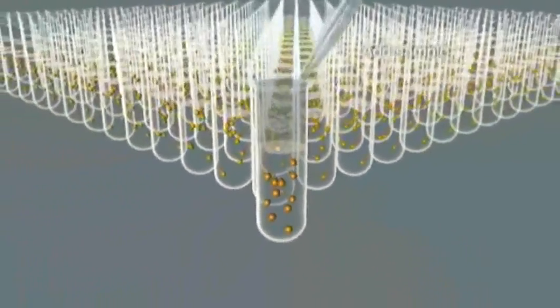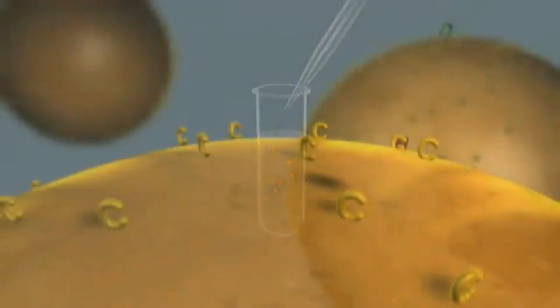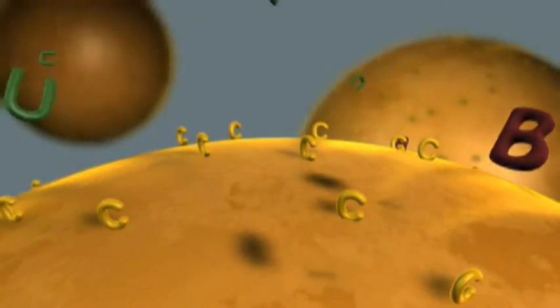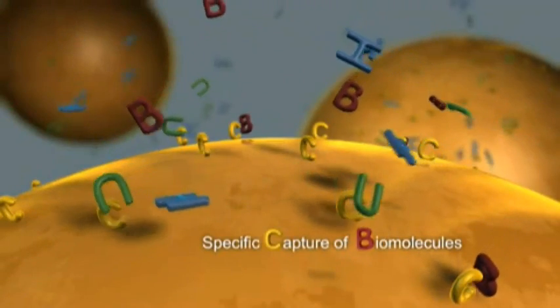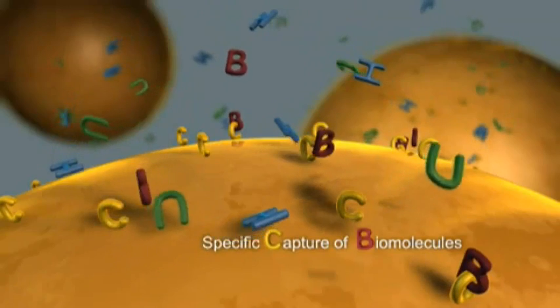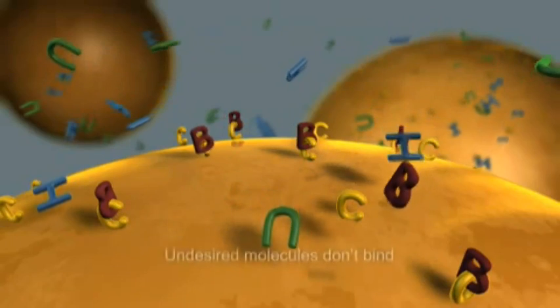The separation process includes 3 main steps. Step number 1 is that magnetic nanoparticles connected to organic molecules that can absorb specific target biomolecules, following the lock and key principle, are added to the solution.